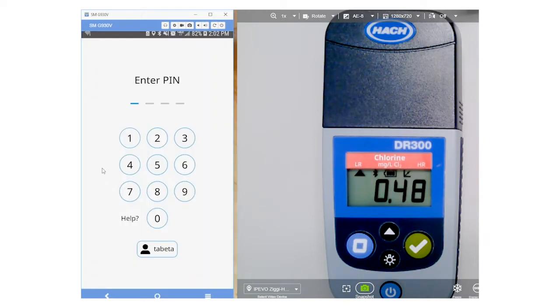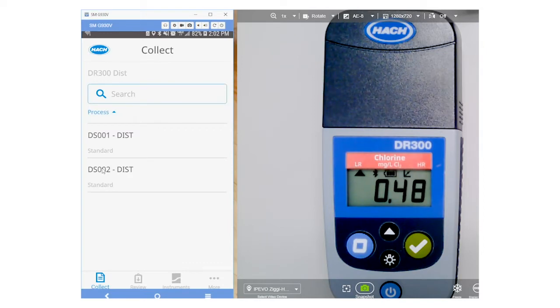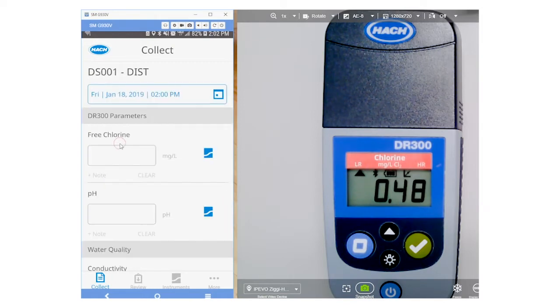It's going to pop up and ask me for my PIN. I type it in, and I'm logged into Collect. It's going to show me my two distribution sites that I have set up. I'm going to go ahead and click on the first site that I want to collect data for.